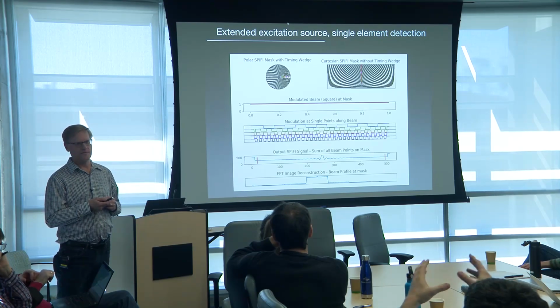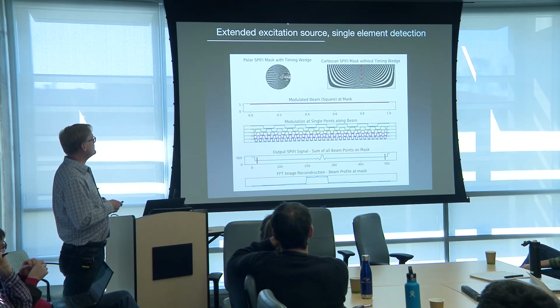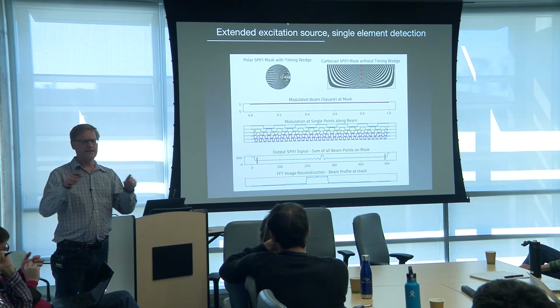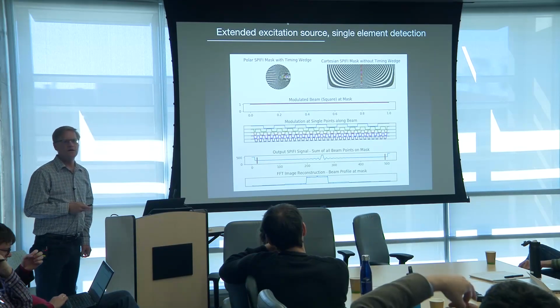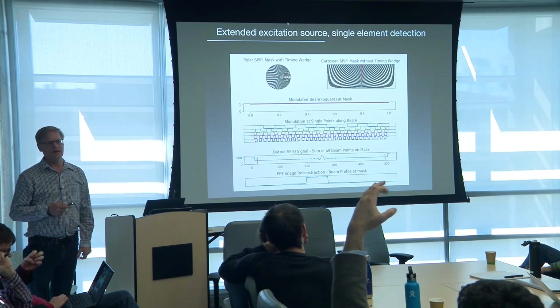So this is a sum of many of these little squares, or you always go point by point, so you don't have this problem. We're projecting that line all simultaneously, and we're going to collect the fluorescence from that one line. So basically, this gives you the fluorescence profile of that line of your object.